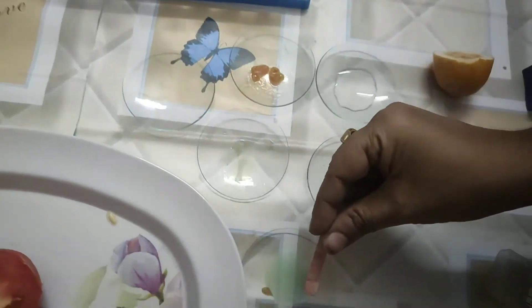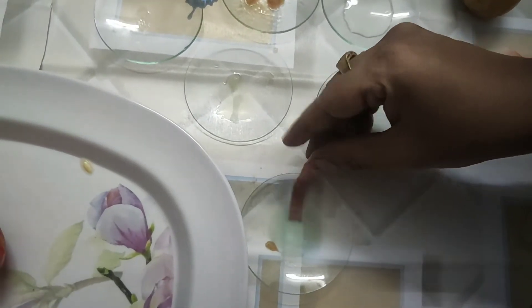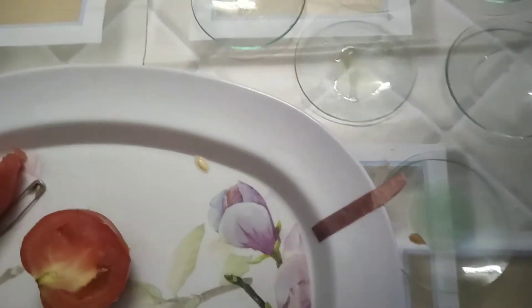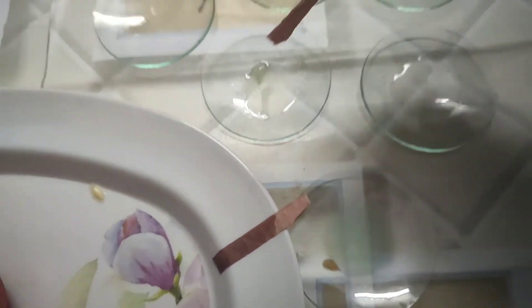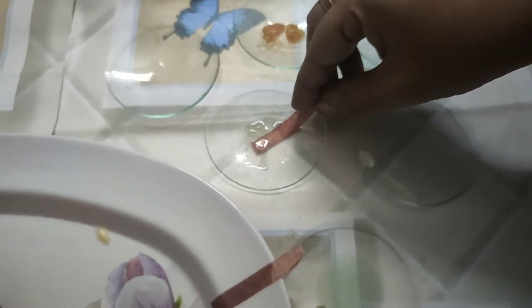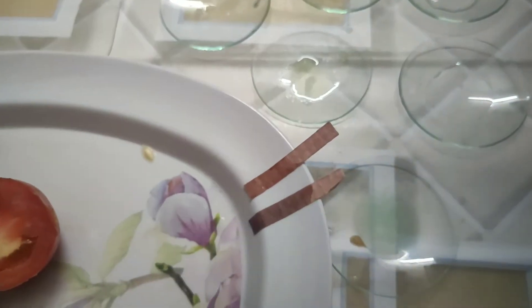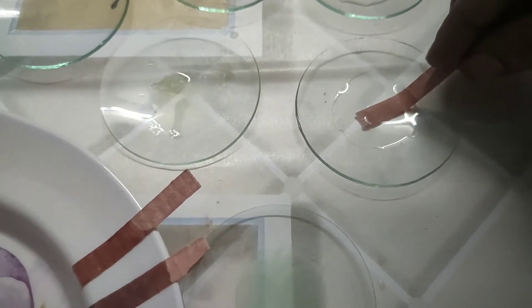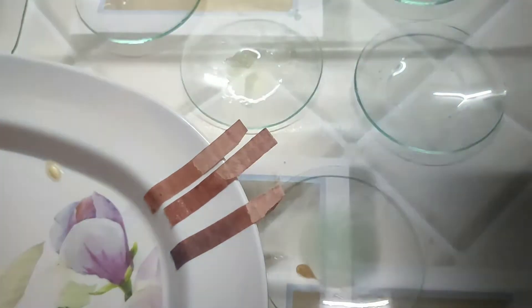Now coming to the red litmus paper — we will test with the red litmus, dipping one by one as we did before. Here I dipped the red litmus paper and we did not observe any change, so that is acid. Here also no change appears — it is also acidic. Acids will not change the red litmus to any color, so red litmus stays red in acids.